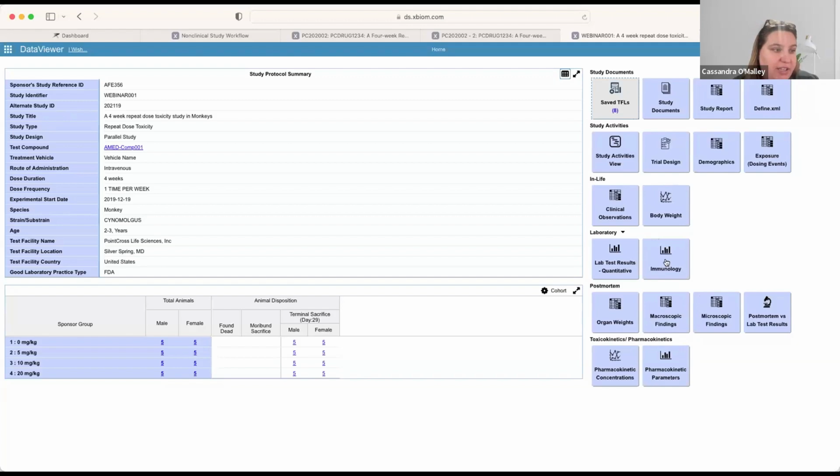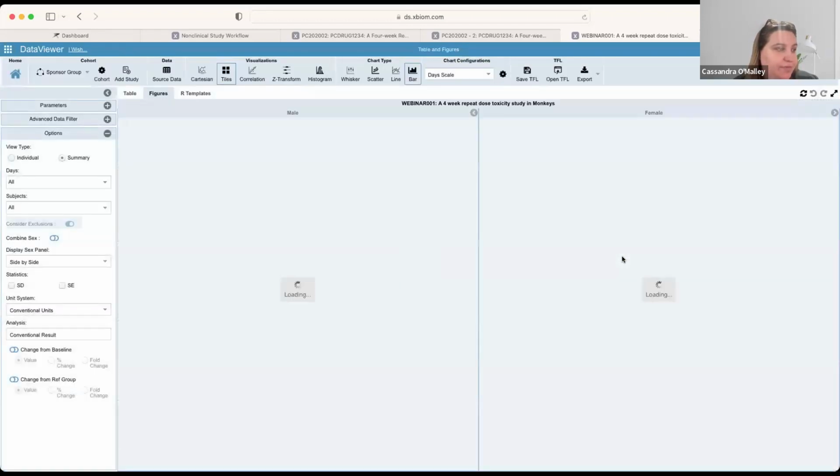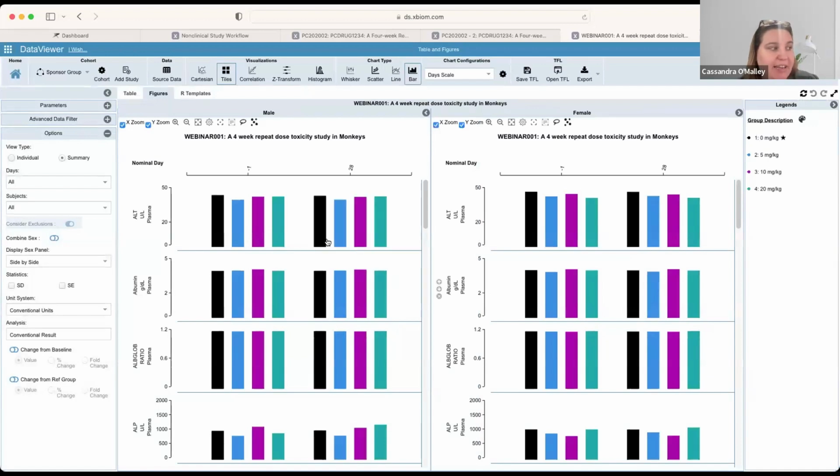So I'm going to take a look at the laboratory tests. We see that black is going to be the control, which is a 0 dose, and over to the teal is going to be the high dose at this time. We've taken days -1 and 28, and I would expect all the groups are approximately the same on day -1, as no treatment occurred. If the values on day 28 are much higher or much lower than other groups, there may be some sort of treatment-related effect.